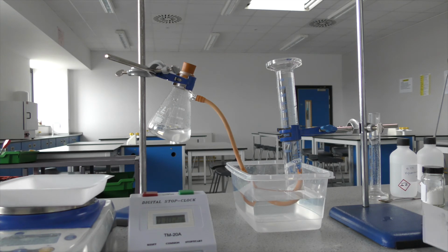That was still at 0 after a minute. You can see those bubbles are going, just not very much. This was with our large chips. And that's another 0. So I'm going to pause now. I'm going to continue this for another 4 minutes.